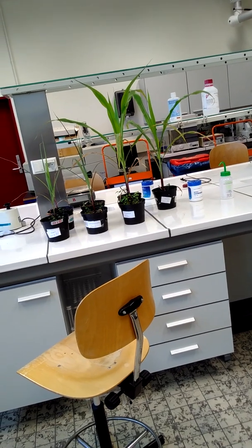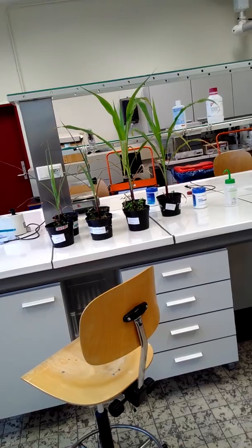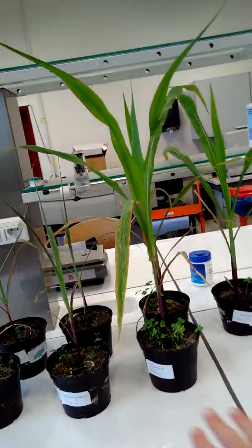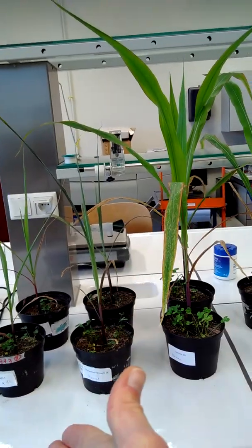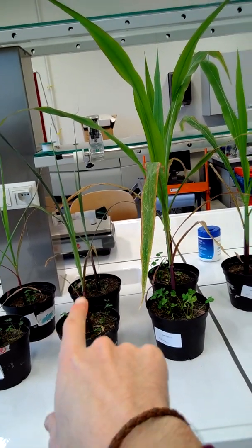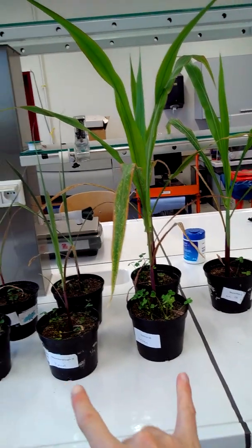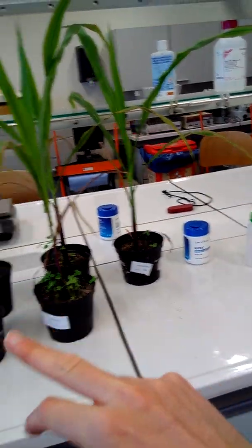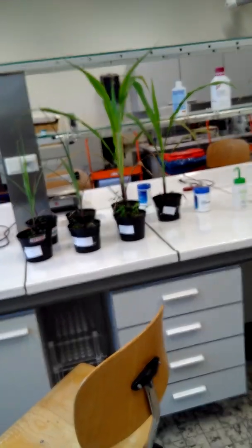What's maybe more interesting, and you should definitely do as well, is calculate the total transpiration of the whole plant per unit leaf area. So once you have the total transpiration rate for the whole plant, you should divide it by the leaf area. And then it's interesting, because maybe it's the other way around: maybe this one will be higher than that one. Of course now I'm comparing two single plants, but normally I think we had 3 replicates. Here I just took 2 upstairs. And you can compare them statistically.